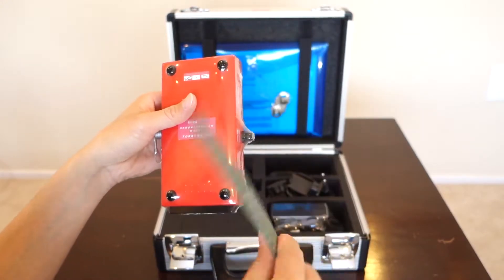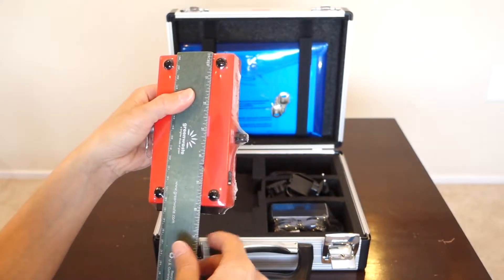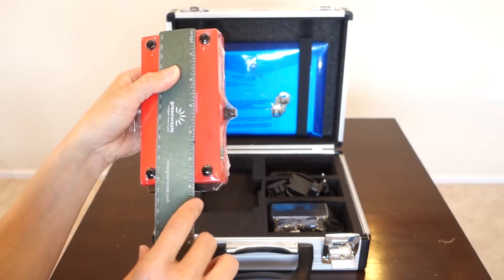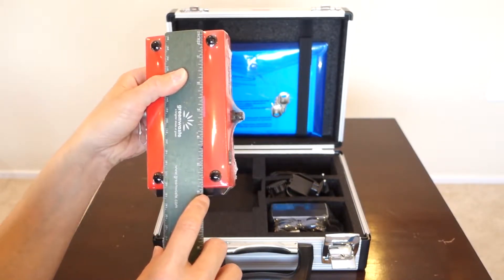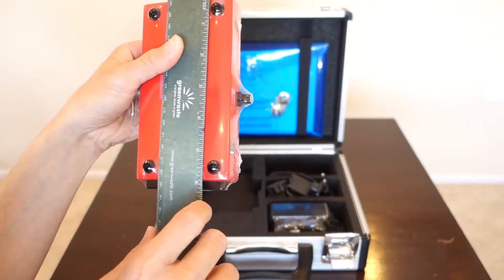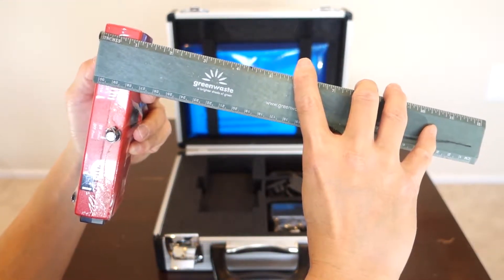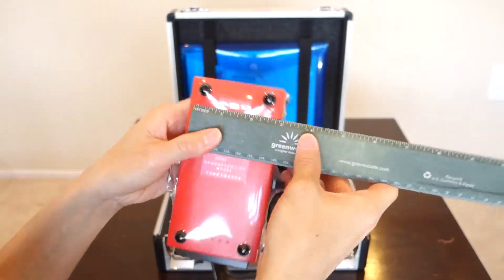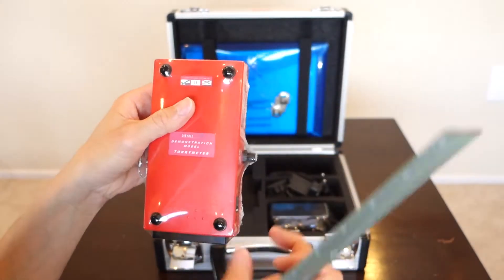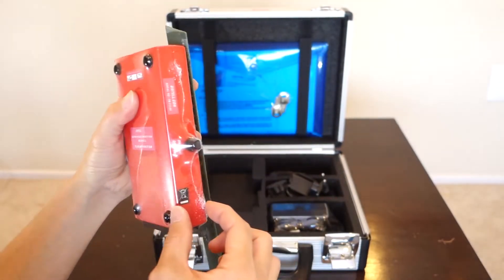Let me take out my ruler and show you how small it is. From top to bottom, it's around five and three-quarters inches in length. The depth is about an inch, and the width is just around three inches. So roughly three inches wide, five to six inches long, and an inch deep — very, very small.